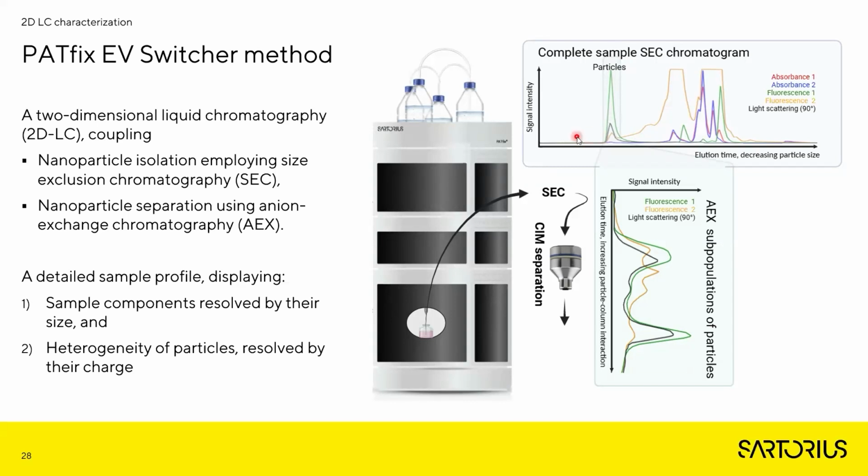The first step of this method would be the same as described, but in this process, we capture the particles and direct them to another column in which they are separated according to their charge. The result of such two-dimensional analysis would be a complete profile of components resolved by their size and the heterogeneity of particles resolved by their charge.